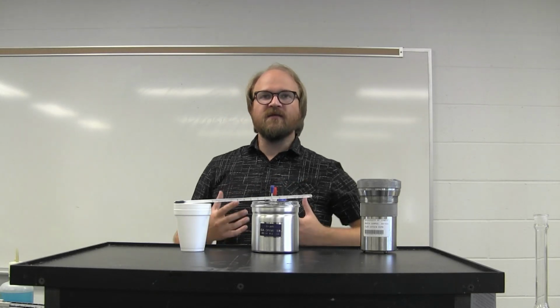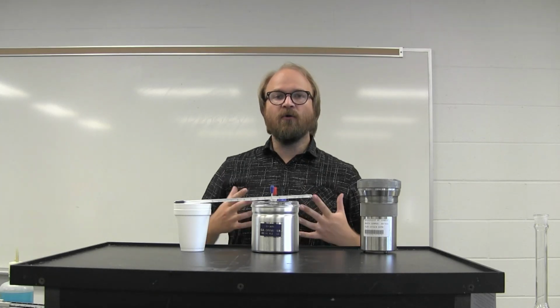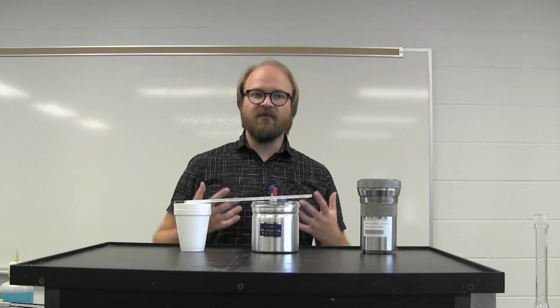Calorimetry is the measurement of heat energy, or the enthalpy, that's associated with nearly every single chemical reaction or physical process that happens. Many times you would use a calorimeter to measure this heat. This is based on heat capacity or the specific material.